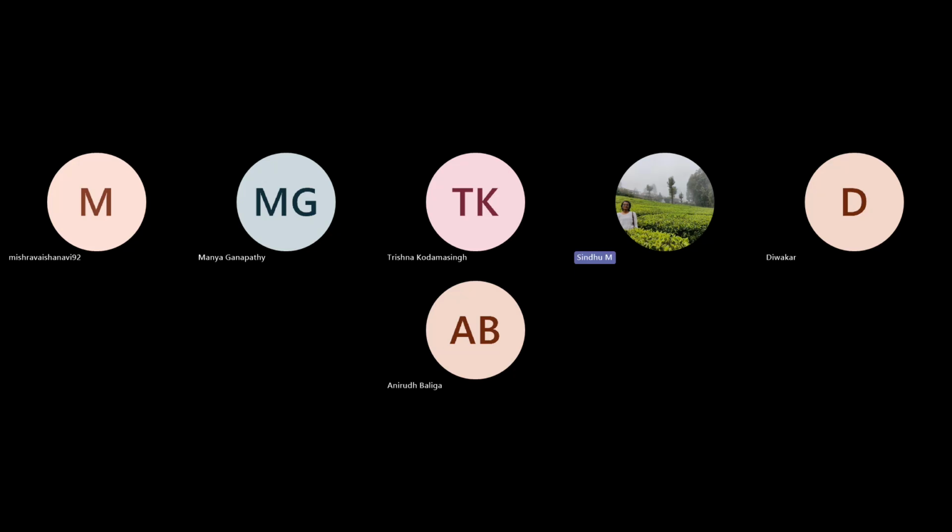Generally, when you take images in a microscope, you can also set the depth at which the imaging is done. Some microscopes have 16-bit, some microscopes have 32-bit. Generally, it's better to go with a higher resolution imaging, and then later in the analysis, if you want, you can change the bit depth.